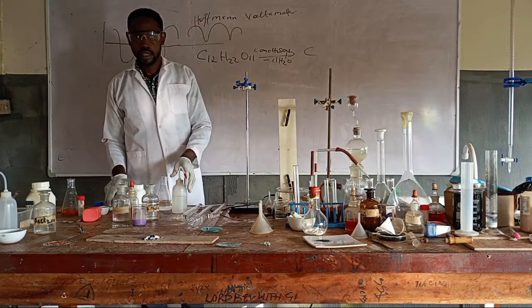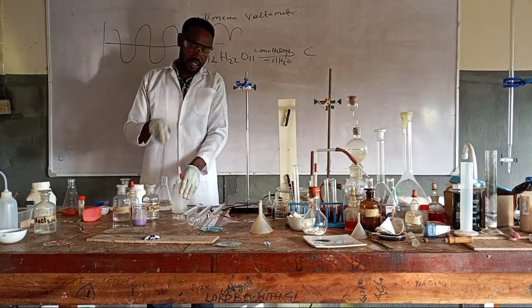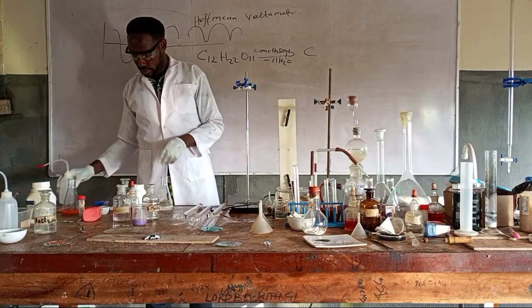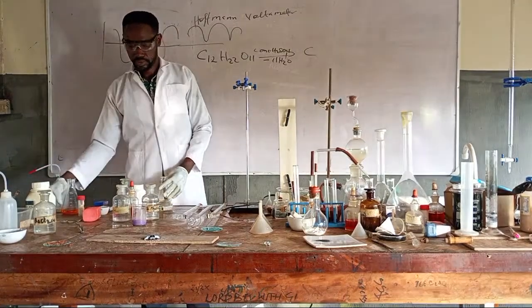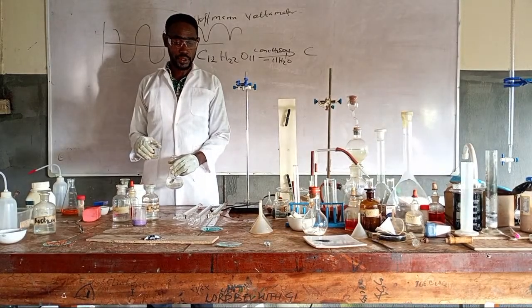Is it harmful to the skin? Yeah, it's harmful now because the acid is yet to attack it very well. But if you pour the acid on your body, it will dry you, dehydrate you.